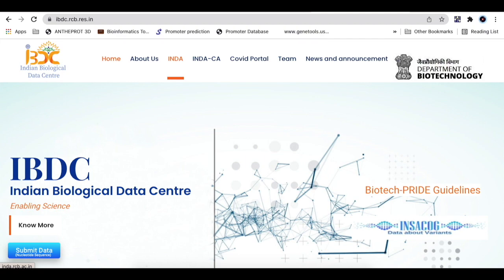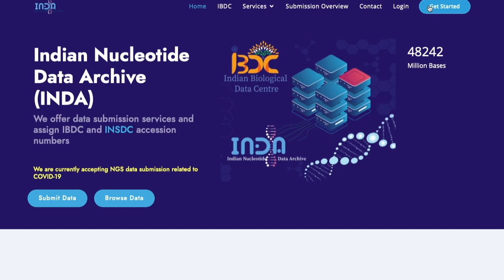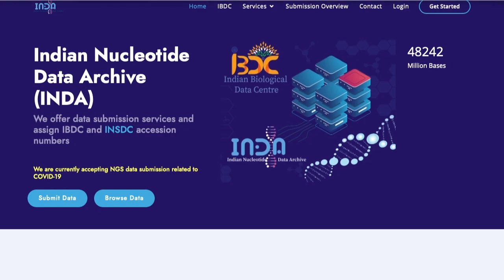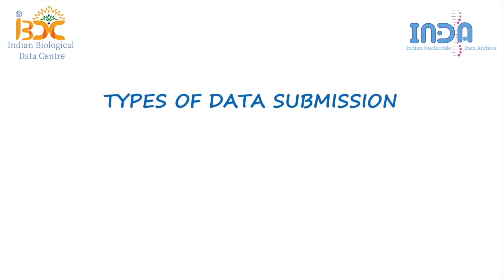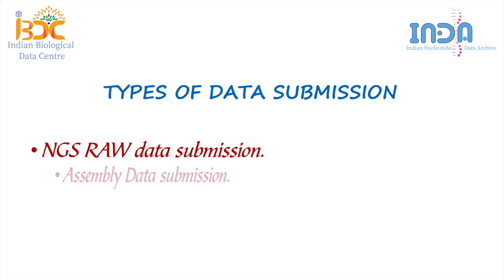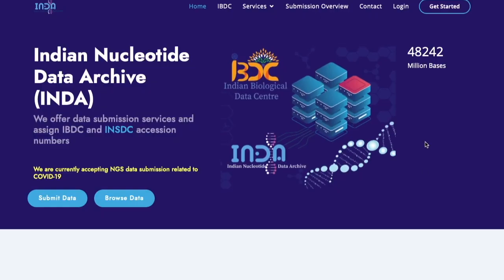Here is the guide for nucleotide data submission at Indian Nucleotide Data Archive, INDA. Indian Nucleotide Data Archive is a portal at IBDC which accepts various formats of nucleotide data submission. There are three types of nucleotide data submission options available at the Indian Nucleotide Data Archive: NGS raw data submission, assembly data submission, annotated sequence data submission. This guide provides an overview of data submission process at the Indian Nucleotide Data Archive.